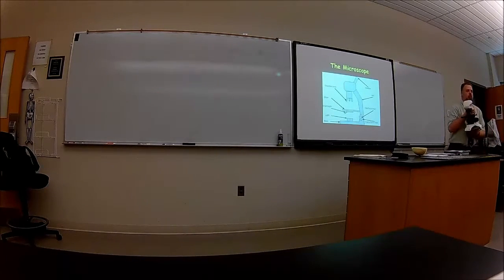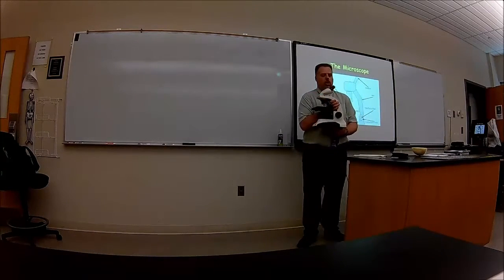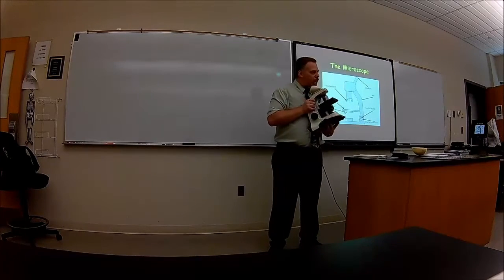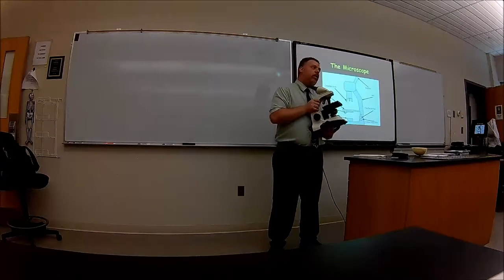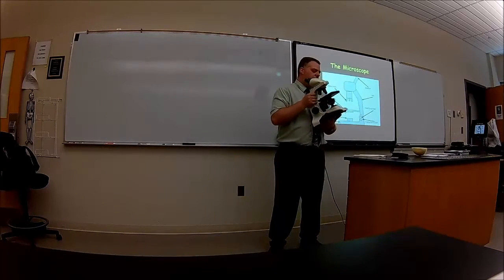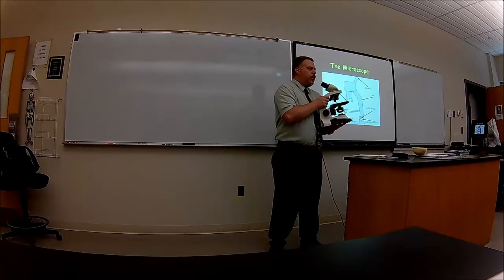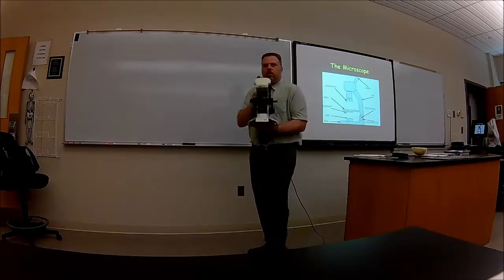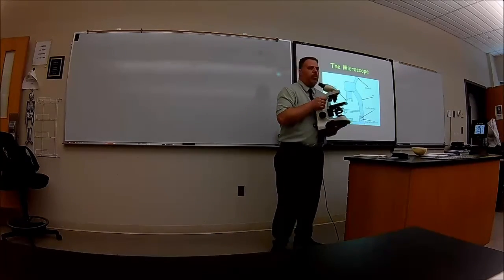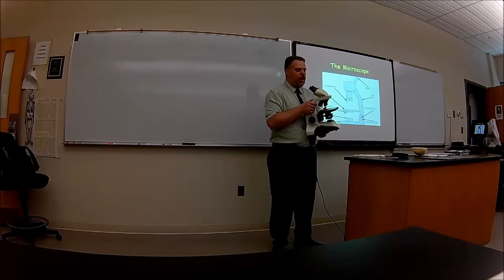Most of the microscopes will look something similar to this that you'll see in the cupboards down below, or where we keep the microscopes. They're not heavy, but they're not light, but they are expensive — each one is probably around $3,000 to $4,000. So the best way to carry it is to put your hand on the base and then the other hand on the arm, and that should make it so it won't wobble or fall. That's how you transport it to your tabletop and vice versa.